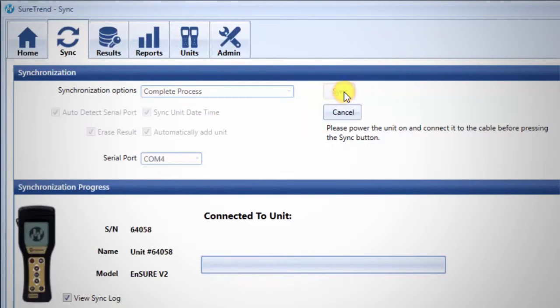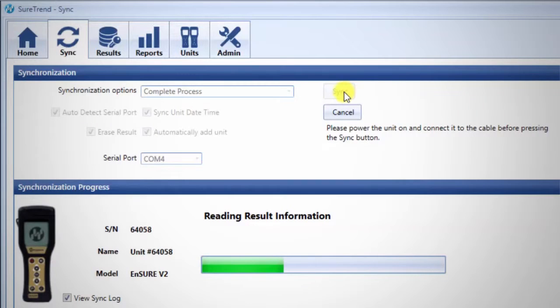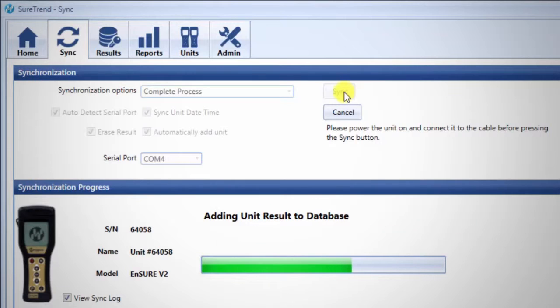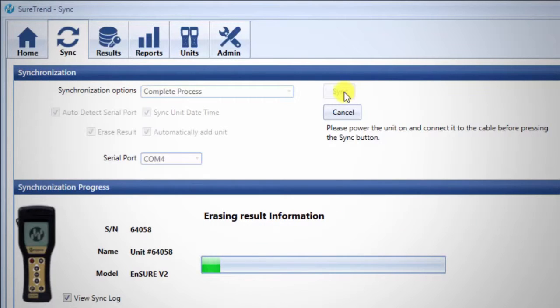Several steps will occur automatically. First results will be uploaded from the unit to SureTrend Software. Then any changes to locations, test plans, and users will then be copied to the unit. Finally, if you selected the checkbox next to Erase Result, test results will be deleted to make space on the unit for more testing.